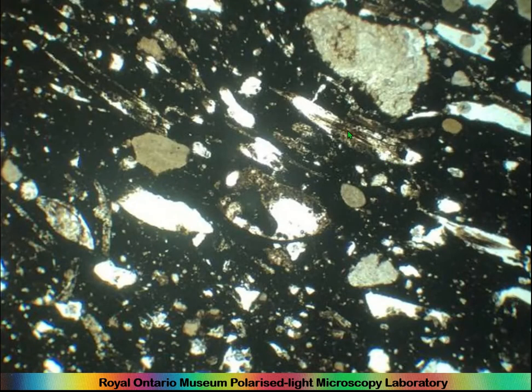And here's another one. You can see here it's slightly curved, and here again it looks like it's slightly curved, and possibly here. So it's possible that this is chaff. Chaff is the outside shell of things like wheat, of which there is a lot in early agricultural civilizations, and so it makes a very useful tempering agent, but it's nowhere near as common as many archaeologists say it is.